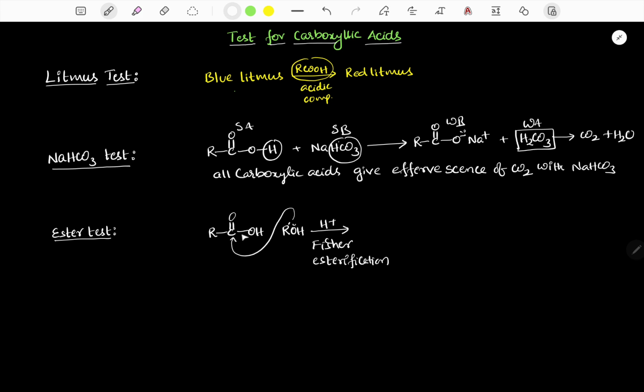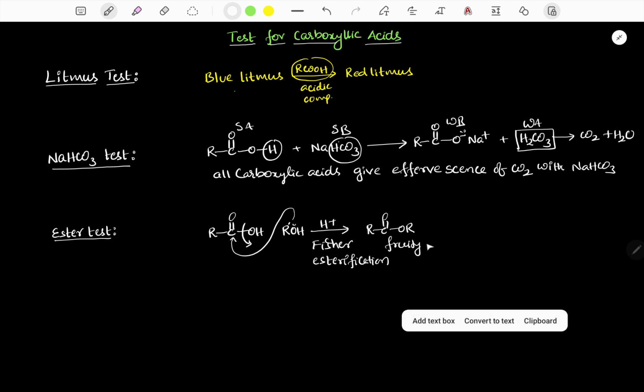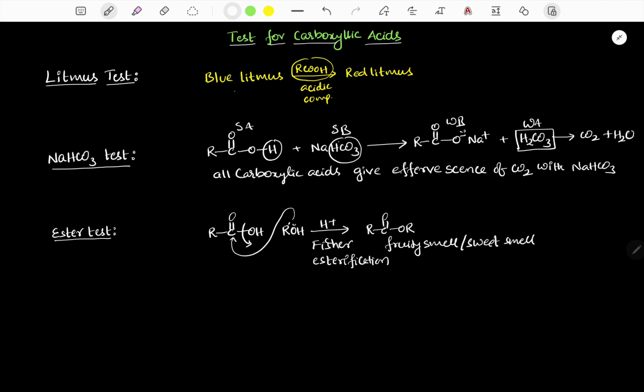So the corresponding ester will form, and generally carboxylic esters have a fruity smell, or sweet smell. The sweet smell indicates the compound can be an acid or alcohol.